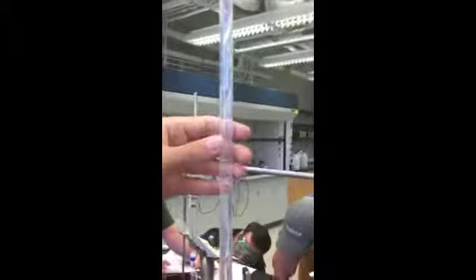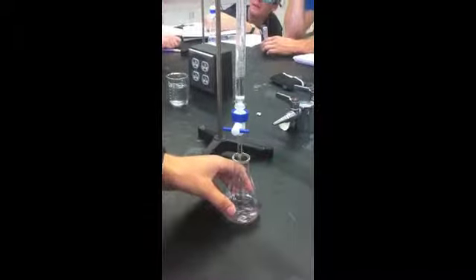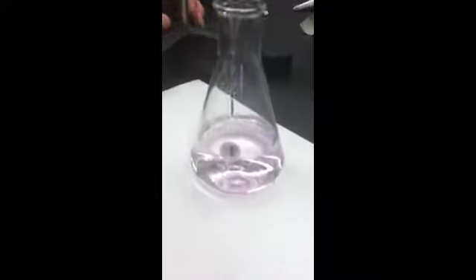First, the initial volume is recorded. As you can see here, Nick is pointing. Now he's going to begin the titration, so he lets a little bit of NaOH out of the tap and then swirls it. And he'll continue this process until it turns into a faint pink, which you will see about now.